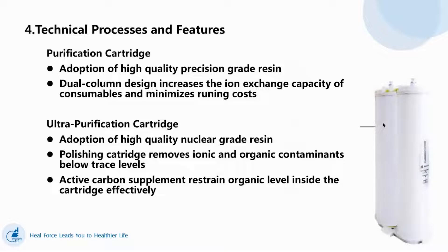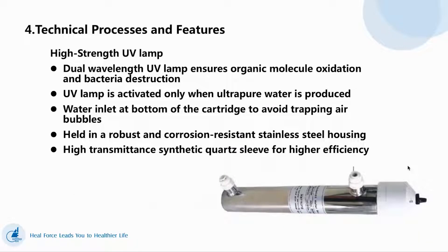This is our purification cartridge and ultra-purification cartridge. The RO water will come through our purification cartridge and become Type 2 water. Type 2 water then comes through our ultra-purification cartridge and becomes Type 1 water. Our UV lamp is dual wavelength — it can reduce TOC and bacteria.